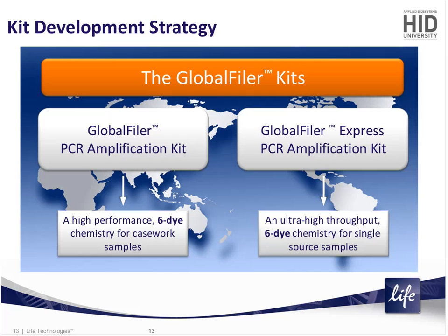And unfortunately, what tends to happen is if you optimize for efficiency, you do start to compromise some of the critical casework metrics that you would measure a system by when you're looking at it on your samples. For example, in order to get the high throughput and in order to get the capacity to deal with unpurified samples for a direct amplification system, what can sometimes happen is that from a casework perspective, your specificity might start to drop a little bit.